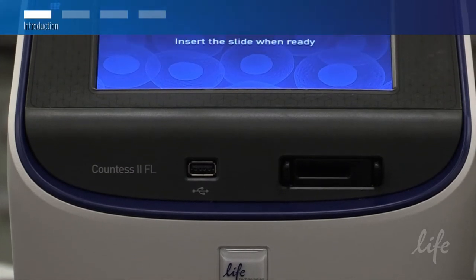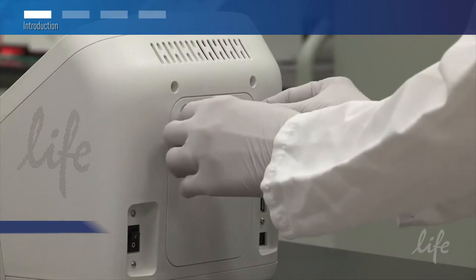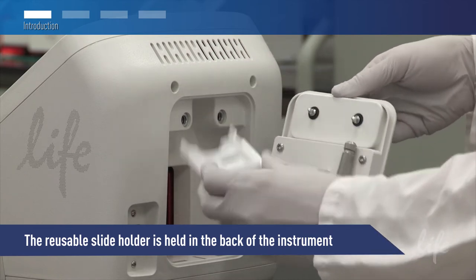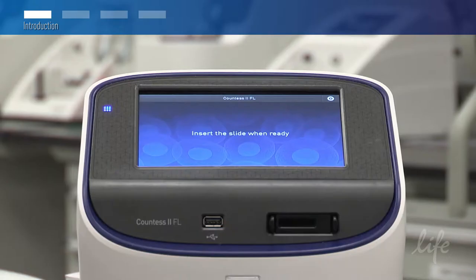The Countess 2FL automated cell counter offers the option of using a reusable hemocytometer for counting cells to significantly reduce long-term consumable costs. In this video, you will learn how to use the reusable hemocytometer slide for the Countess 2FL automated cell counter. Let's get started.